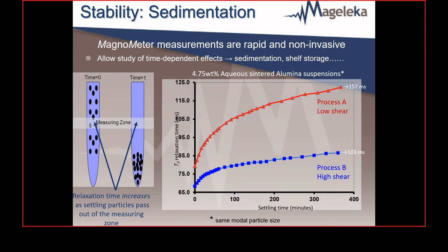But a large number of industrial materials comprise broad particle size distributions with non-spherical particles. NMR relaxation measurement doesn't suffer from the limitations of this technique. It's fast, direct, and quiescent; the size and shape of the powder material is immaterial.